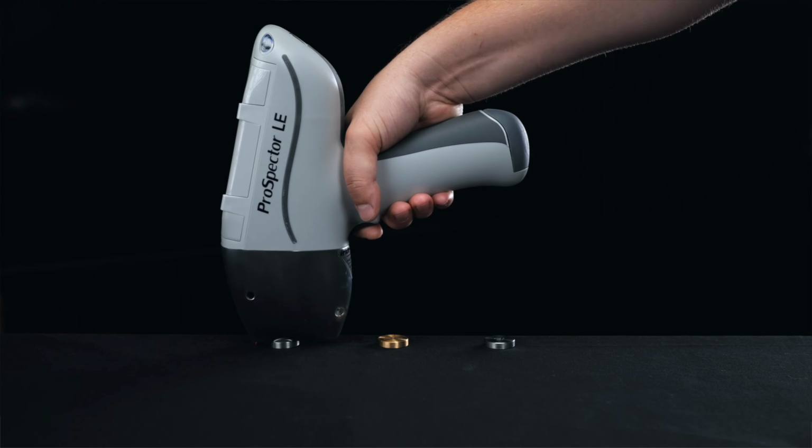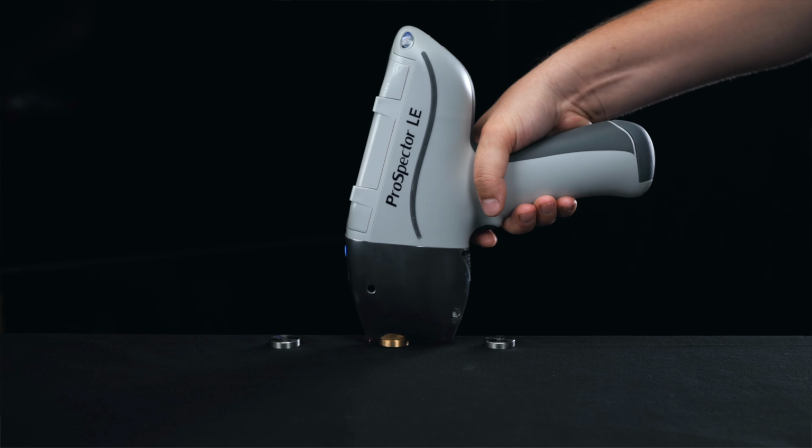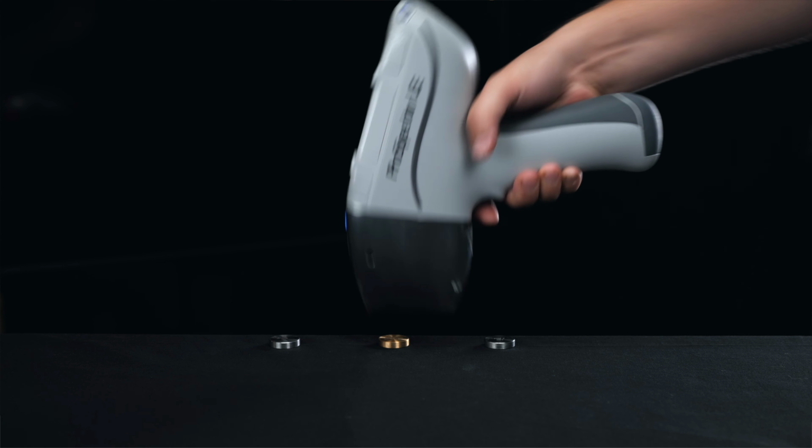Most geological, cement and ceramics laboratories work with oxide composition because, first, technical specifications and international standards usually define composition as SiO2, Al2O3, Fe2O3 and so on. Raw mix calculations for clinker, glass or ceramics are done in oxide form. Results are often compared with an external laboratory where composition is also expressed in oxides. ProSpector 2 allows you to get this oxide format without any manual calculations. The analyzer does everything for you and shows the ready oxide balance on the screen.